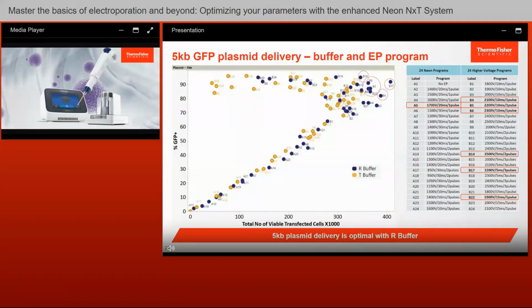In the first column, we have Neon 24 optimization program that comes with the instrument as defaults. In addition, we created 24 more higher voltage programs with similar pulse width, with smaller pulse width and pulse number. The red circles in the graph indicate the data points that represent the best performing condition characterized by delicate balance between the higher percentage of GFP positive cells and higher total viable number of transfected cells.